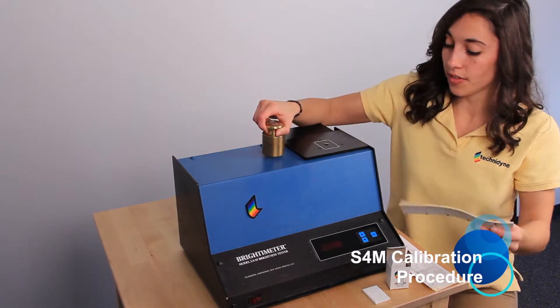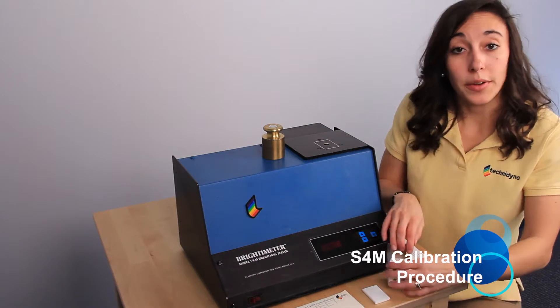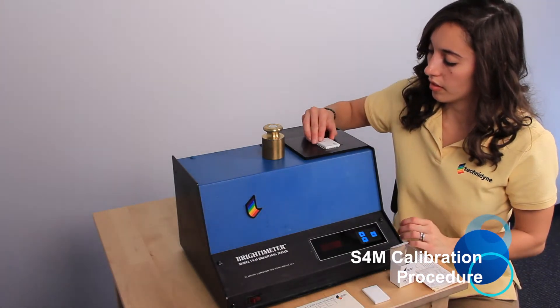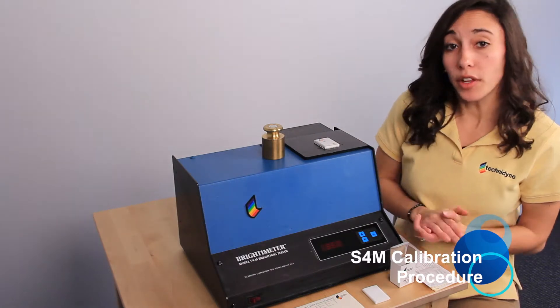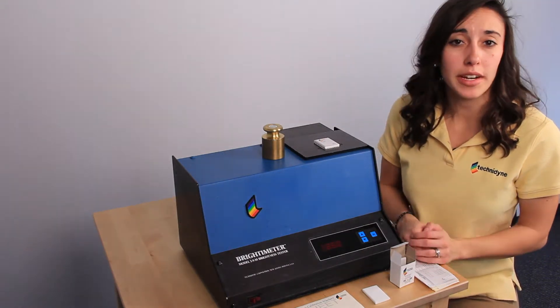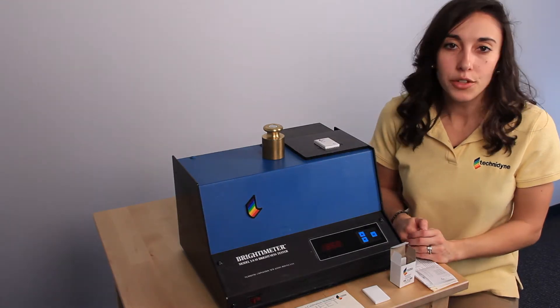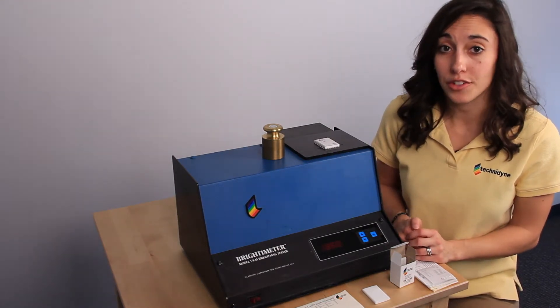We can take our standard off and we're going to load an opal standard. The number on the display should read within plus or minus 0.2 of the number on the opal standard. If it's not, you'll need to refer to your operator's manual for further instructions.